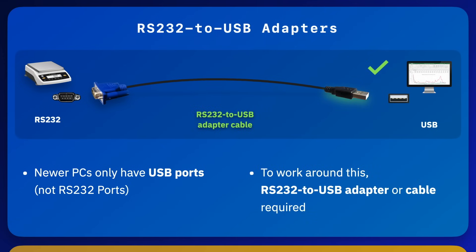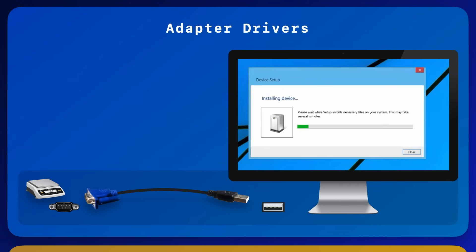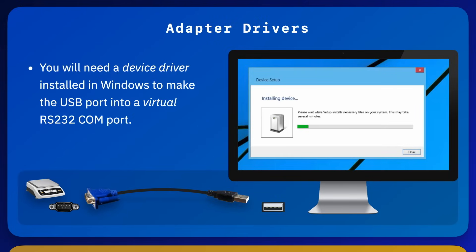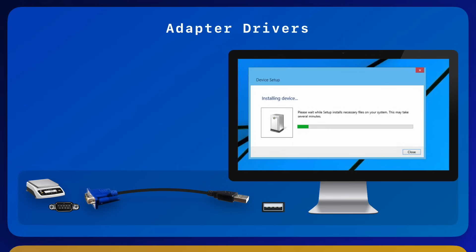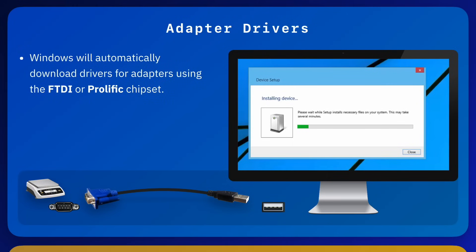When you use an RS-232 to USB adapter, you have to install a device driver for the adapter so that it appears in the Windows device manager as a standard RS-232 COM port. If the adapter uses an FTDI or Prolific chipset and your PC is connected to the internet, Windows will automatically download and install the driver from the internet.